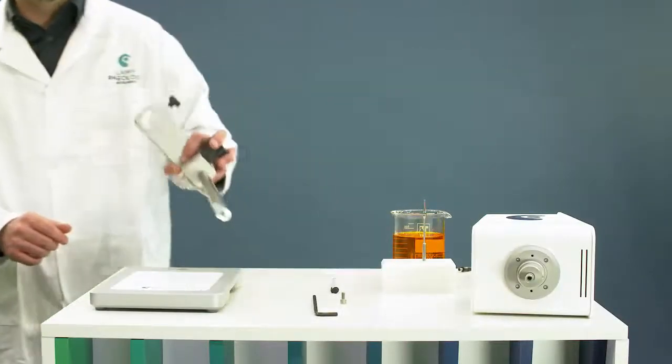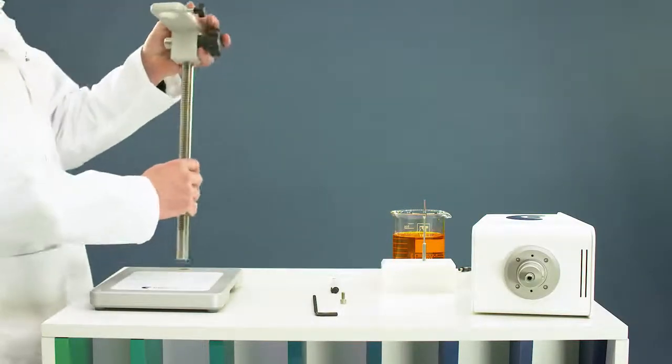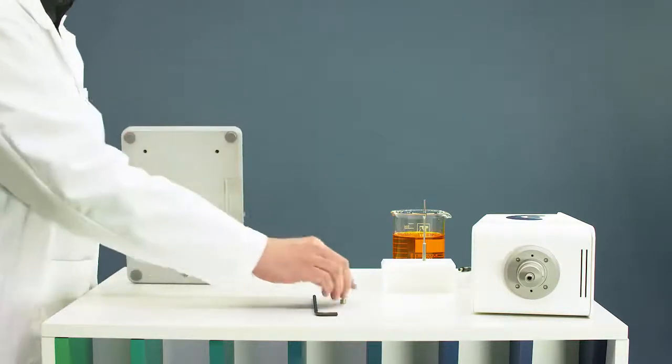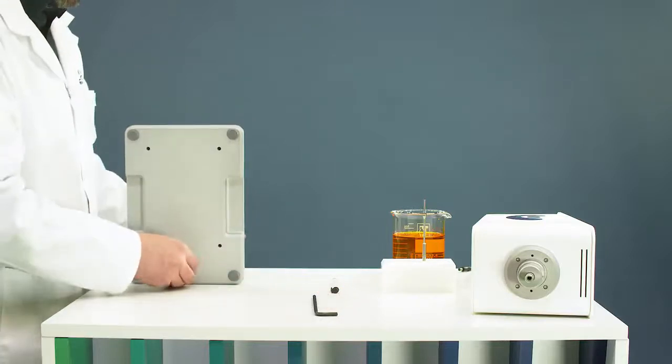Mount the stand to install the viscometer. Present the rod with the arm on the lower plate. Fix the rod with the provided screw.